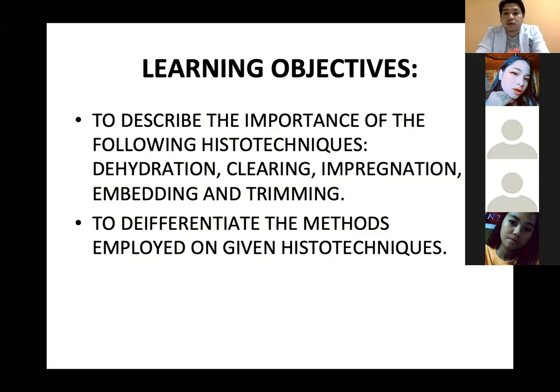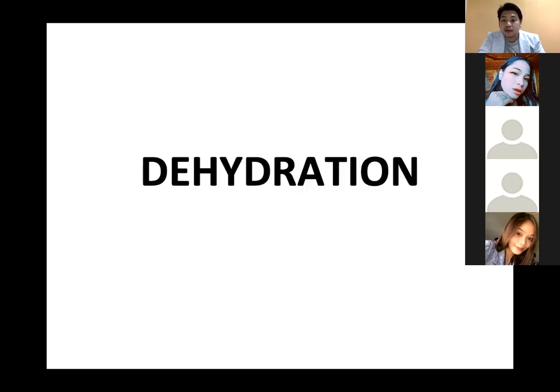Different histotechniques are a pre-analytical procedure done inside the histopath lab, and it is being performed by the medical technologist. So we aid the diagnosis of diseases by processing these specimens for the aid of reading by the pathologist. I've already uploaded fixation and decalcification last week. So today, we're going to start with dehydration.